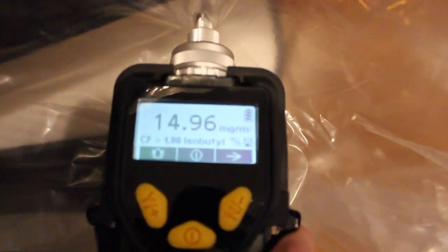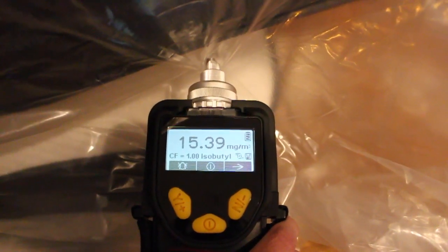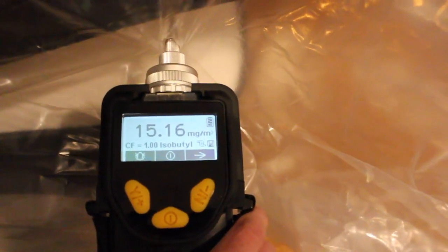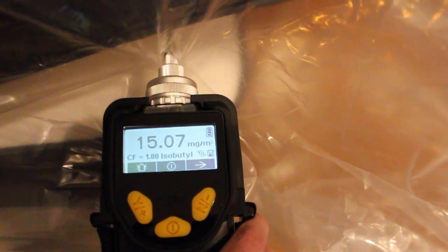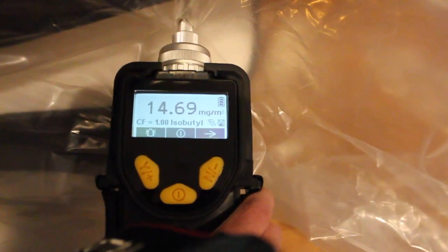We go from 184 to 3,000... 7,000 — it's actually flipped scales now — 10,000... 15,000 micrograms per cubic meter. It was at 200 micrograms and now it's at 15,000 micrograms, or in other words, 15 milligrams per cubic meter. You've got to know the metric scale to understand all this. Suffice it to say, it's gone way over — almost two orders of magnitude difference from normal outdoor air and background levels.